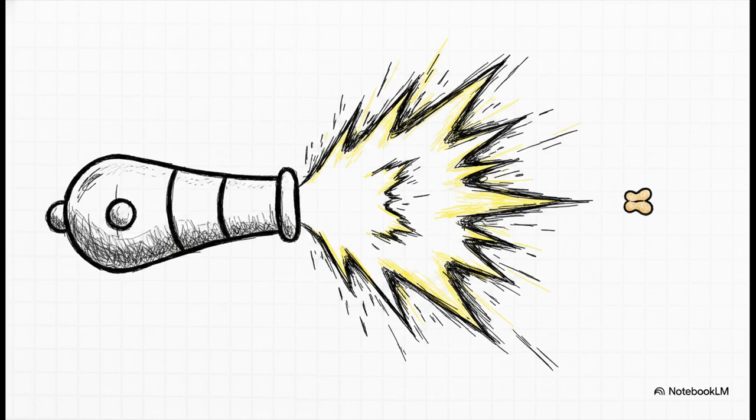Now, the energy required to remove an electron from most organic molecules, which is its ionization potential, is usually only between 8 and 15 electron volts. But to acquire reproducible data that we can actually compare against global databases, a standard 70 electron volt beam is used. It is massive overkill. It's literally like using a cannon to open a peanut. And that massive excess energy is exactly what makes the rest of our story so explosive.